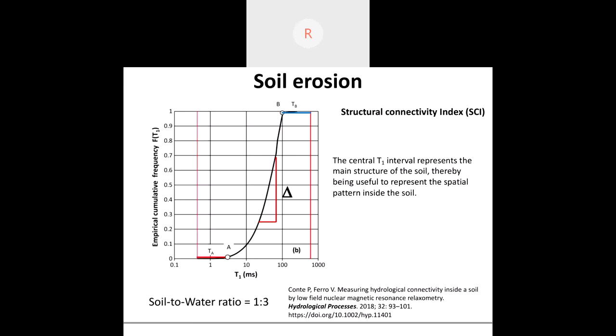But that means that we are doing analysis on a soil that already has problems. While if we are able to quantify earlier the erosion to which the soil is subjected, we can program interventions for repairing this soil.